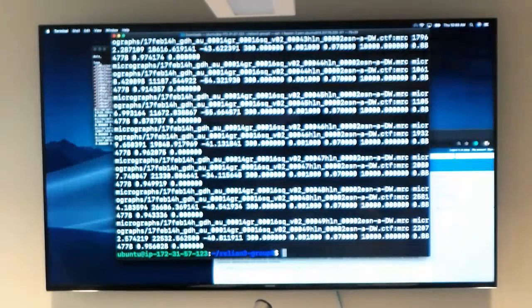And something that you'll note is that the star file gives you a list of the micrographs and CTF estimation information. If you want to use the star file without additional editing, then you would want to follow this directory structure. The directory structure assumes that your micrographs are in a folder called micrographs and that you have this as your micrograph.